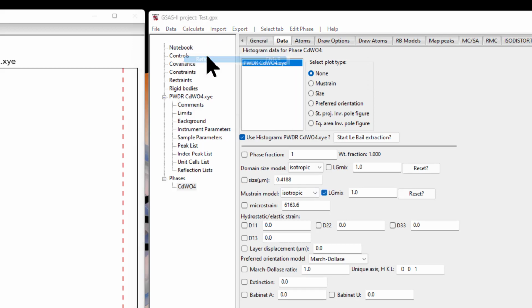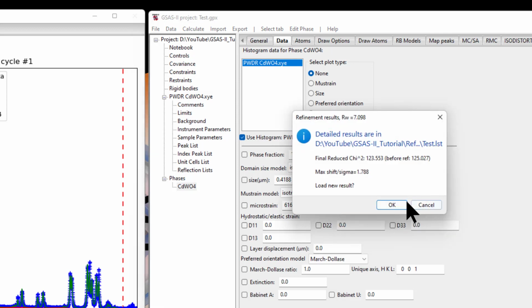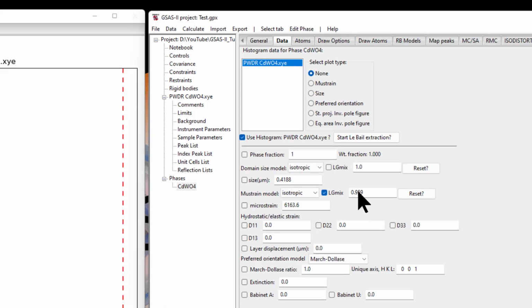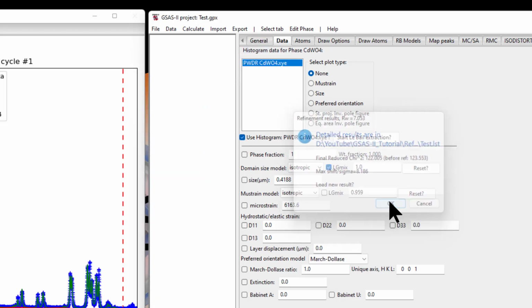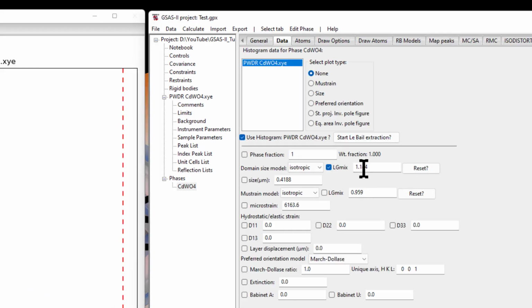Okay, let me check about the LG. Help me to improve. Yeah, it's helping. You see, now the other parameters are optimized, so these numbers are also moving. They have very slight contribution, but that also matters. Any good change? No. Bad.